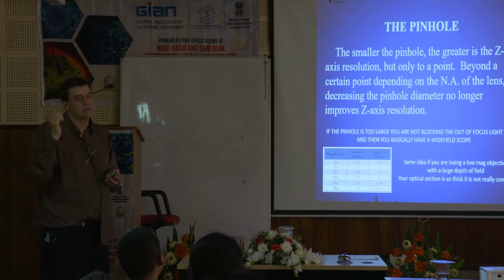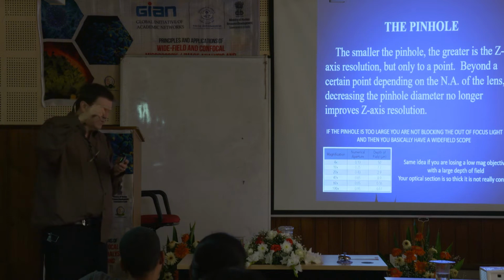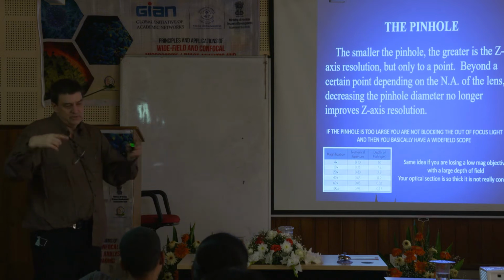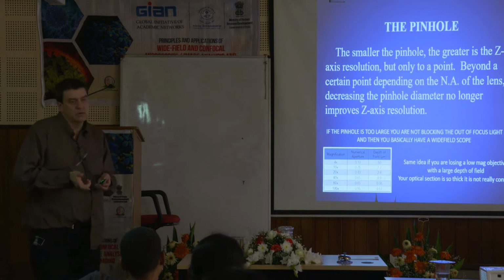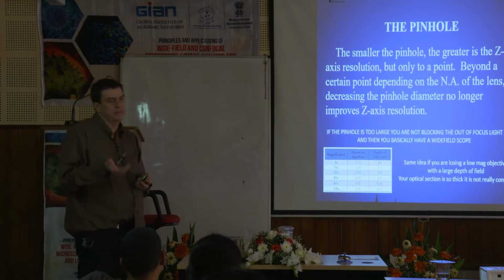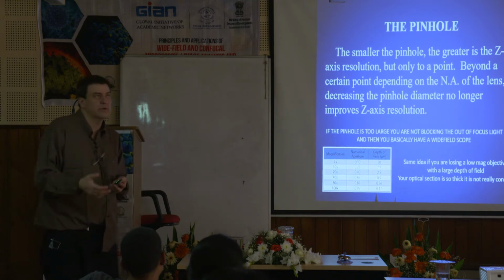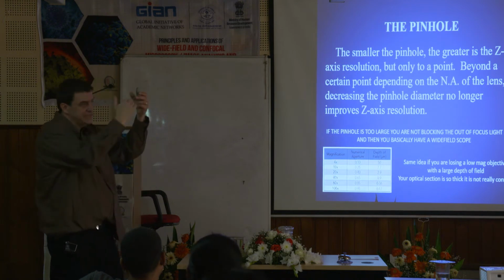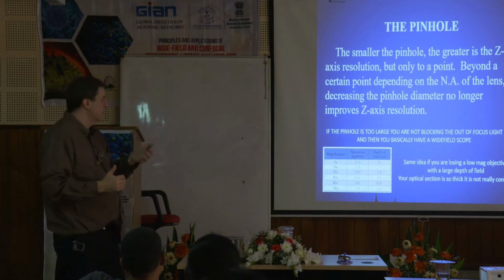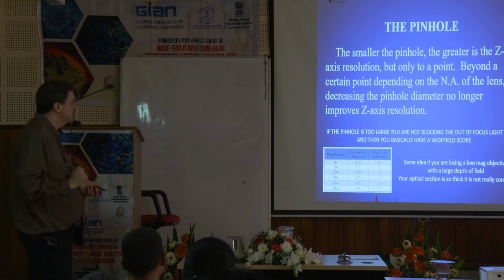Okay, and again, with these microscopes, the way they're designed now, usually when you say you're going to do 63x oil immersion, whatever, using this wavelength, the microscope calculates it and gives you the right pinhole. Okay, I mean, it's good to know the theory behind it, but with these modern microscopes, a lot of times these things are taken care of for you by the computer software. Like I said, the Z step's taken care of for you, and again, the pinhole size is taken care of for z resolution.